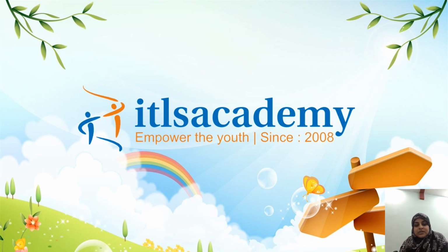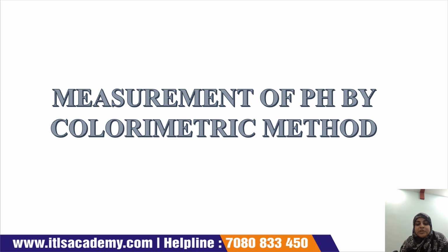Today we are going to discuss the topic of measurement of pH by a colorimetric method. The measurement of pH by the electrometric method has already been discussed and uploaded to our account. You can go and check the video. But here we are going to discuss the measurement of pH by the colorimetric method. Now let's start today's lecture.